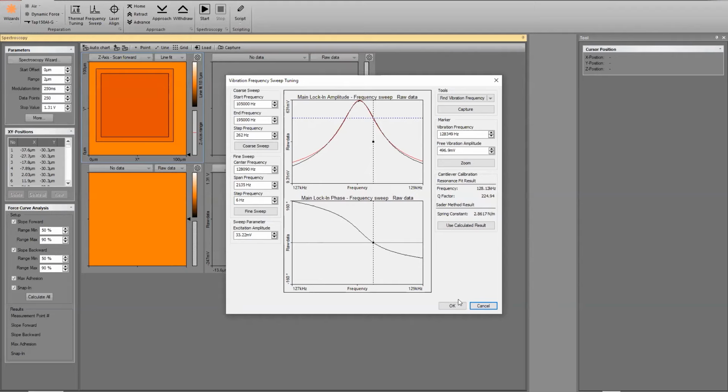And a follow-up question: is it possible to study the force interaction between colloidal beads coated with protein and a cell? Yes, you can do adhesion experiments there. If you have, for example, beads coated with antibodies, you can do the first measurements with one antibody on the cell and check where you find adhesion points, and then change the bead to one with other antibodies or without antibodies as a control, and check adhesion of the colloidal particles with the cell at the different positions.